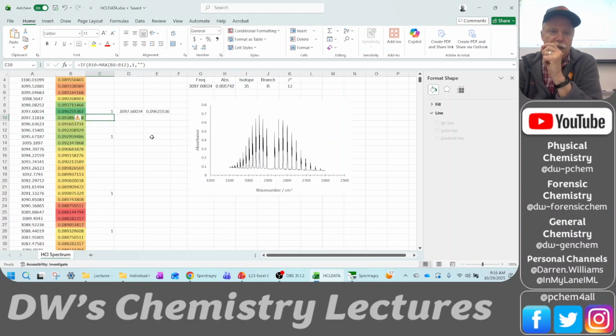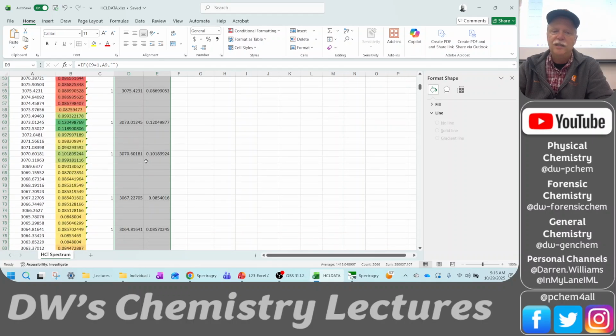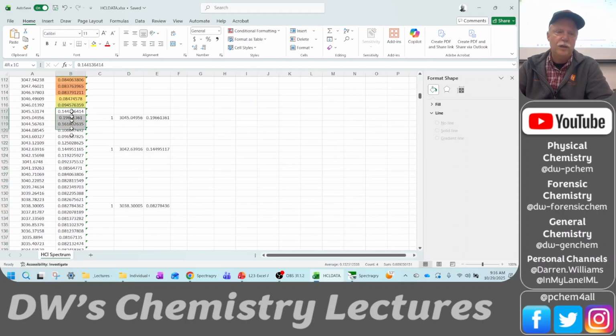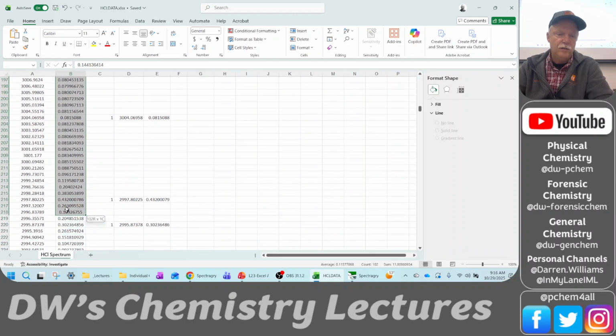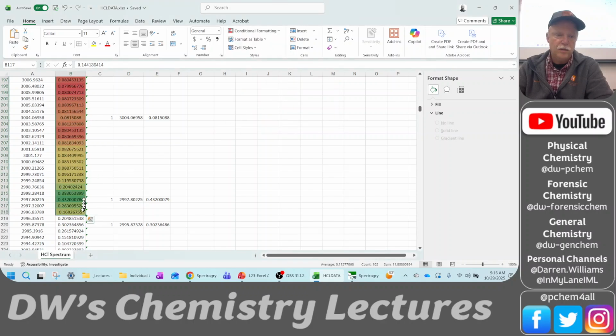Okay, so we have these. These are going to pick all of our flags and give us all our transitions and intensities, even when there's no colors associated with it. But we'll go ahead and put the colors on these. So I'll go down, I'll do the colors this far, and then I'll start another panel for the color.